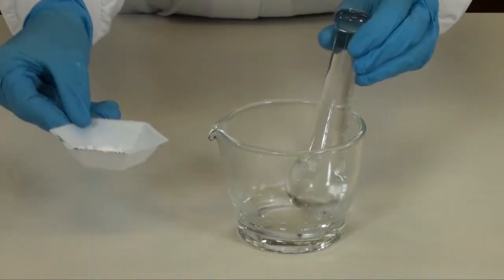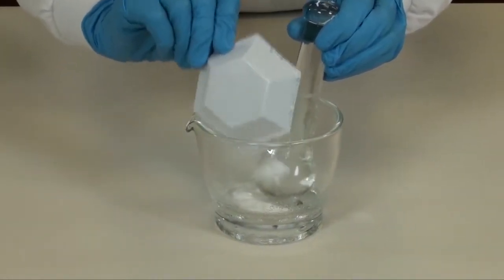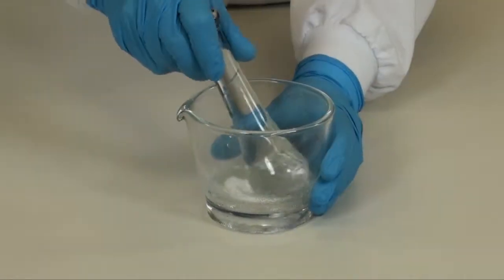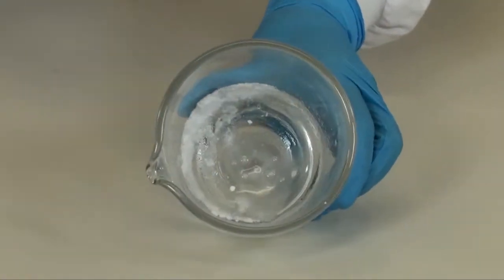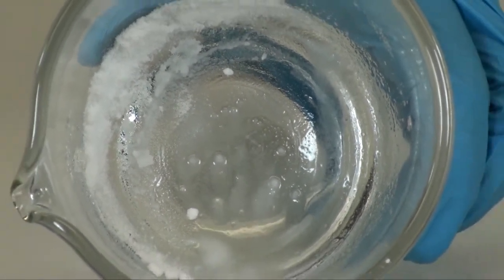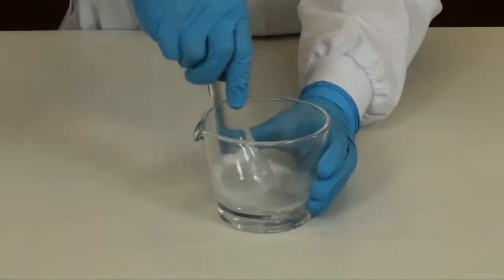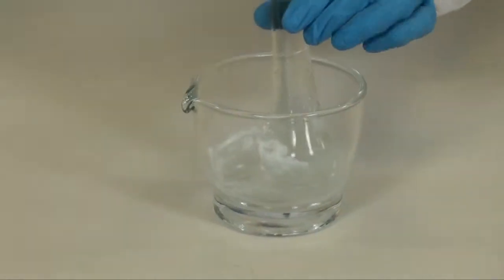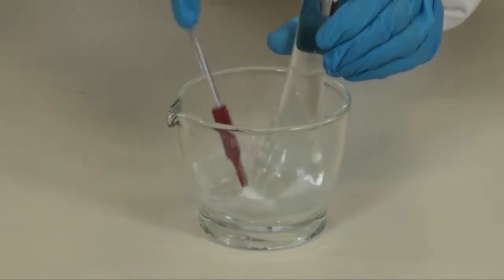Add the benzoic acid to the eutectic mixture. Continue to triturate until uniform. Scrape down the product from the sides and the pestle with your rubber spatula if needed.